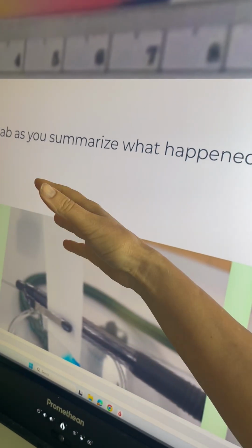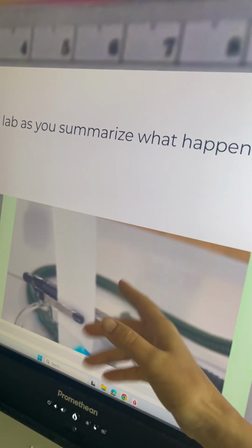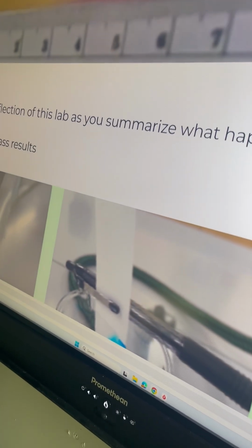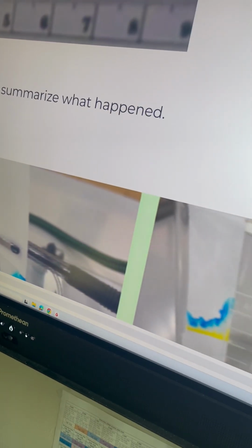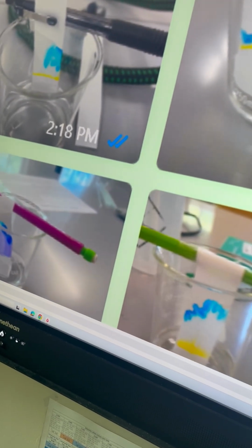And now this is the important part. You may have already done it. You don't have to do it again. But if you haven't done it, just write it. You can write it in the comments that you submit. It doesn't really matter to me. I wanted you to see how the actual lab turns out.